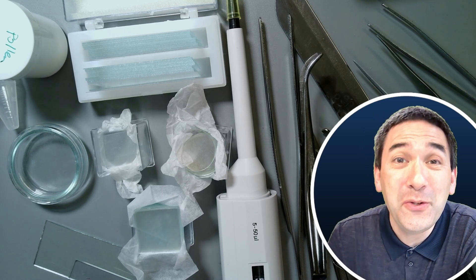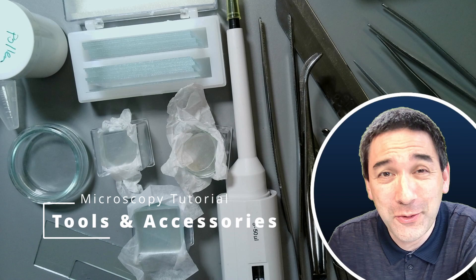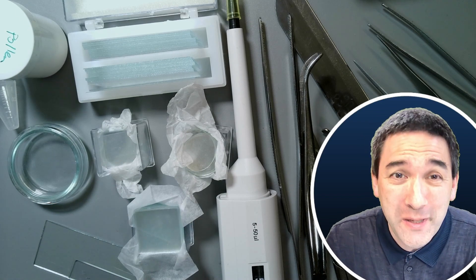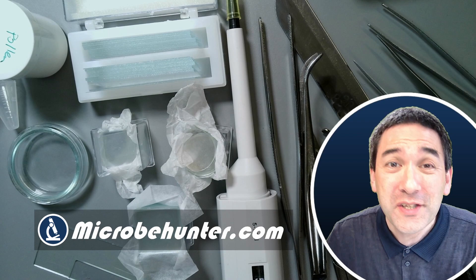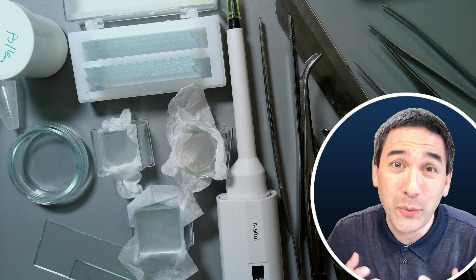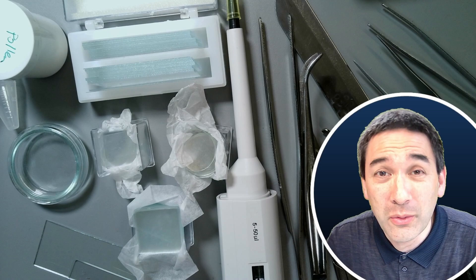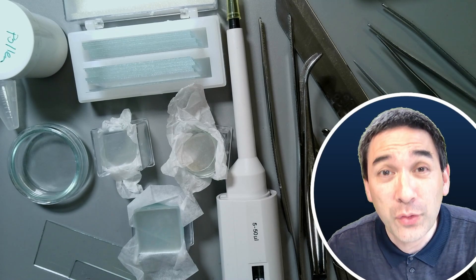Let's start by giving you an overview of all the tools that you might consider useful for microscopy as a hobby. I'm going to divide this video into three parts, or rather the tools you might need into three parts.